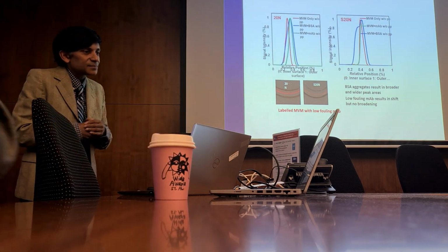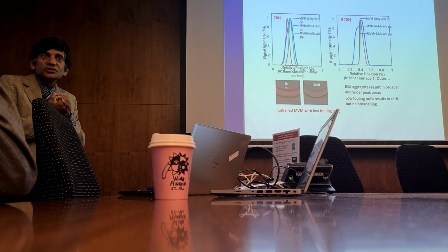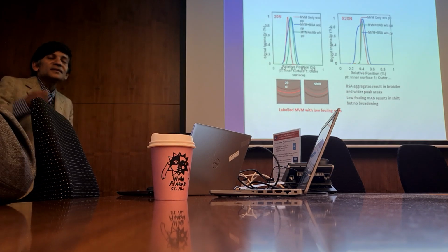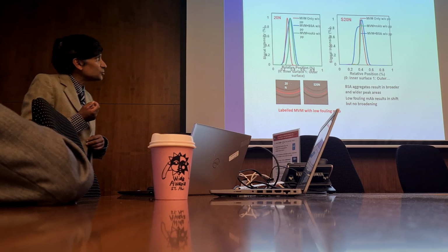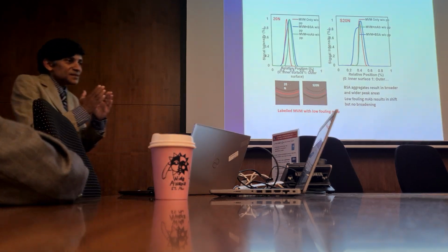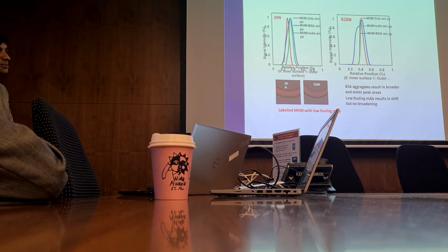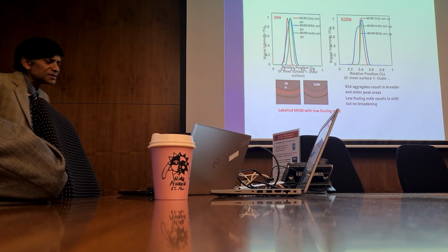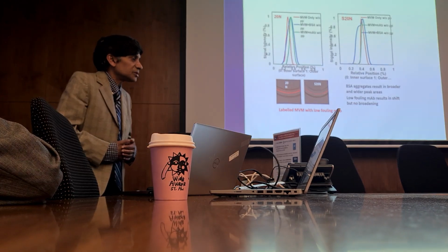But another thing that comes up again on this hypothesis of viruses getting stuck in constrictions is that if you have aggregates present, they are competing for these constrictions with the aggregate particles. And when they do that, then in fact some of them start to get trapped much, much further into the membrane, and there is a possibility of breakthrough. Again, explaining why sometimes when you have fouling of the membrane and dropping flux, you also see breakthrough of virus particles.